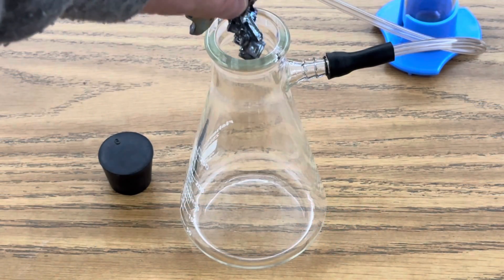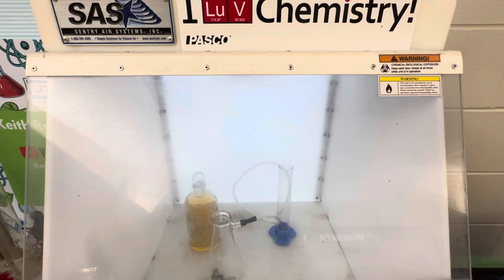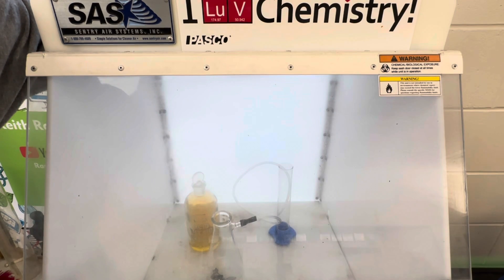The next step is to add my two pieces of bismuth, and then I'm going to raise this up to 60 mils of nitric acid. Since this does release nitrogen dioxide, I will be using my fume hood for portions of this video, so I'm going to start that up right now.